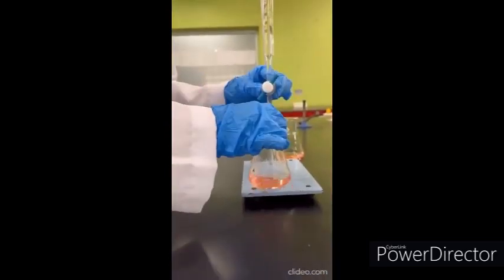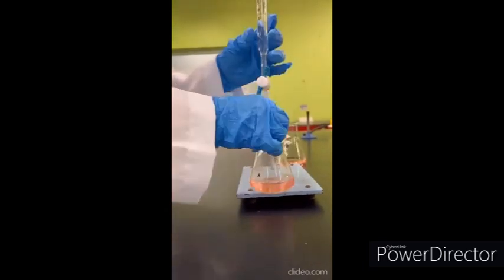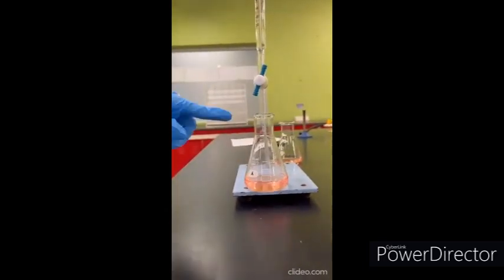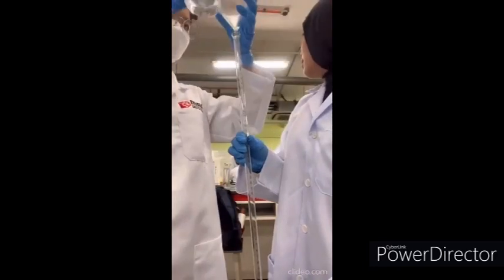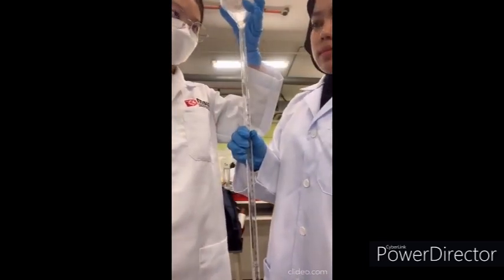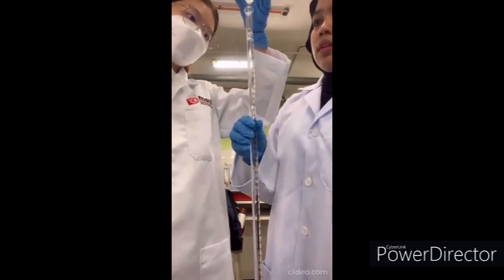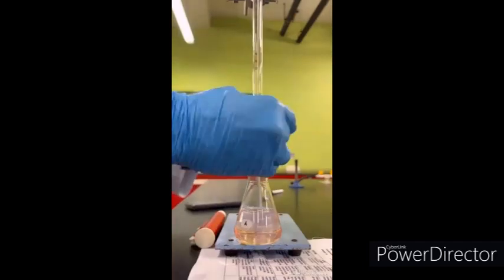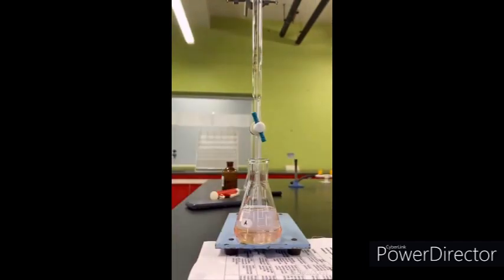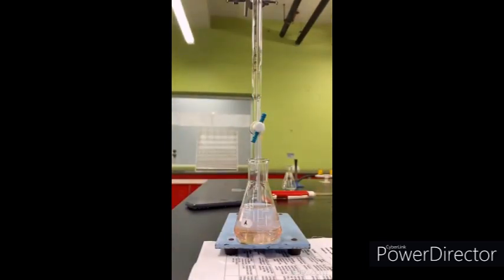Place the conical flask under the burette and begin to titrate. During the titration, swirl the conical flask continuously to see the color change. The solution becomes a lighter pink as the sodium hydroxide is added. Another burette is filled with the sodium hydroxide until it reaches the 0 mark, and then the titration is continued with the refilled burette. At this stage, the color of the solution is still pinkish, which shows that the solution is still acidic and it has not reached the neutral state yet.